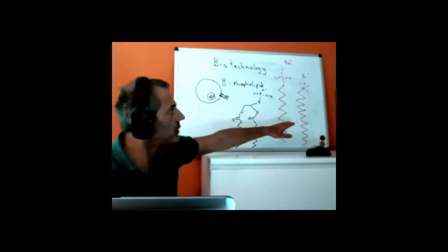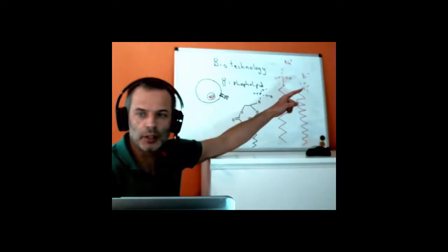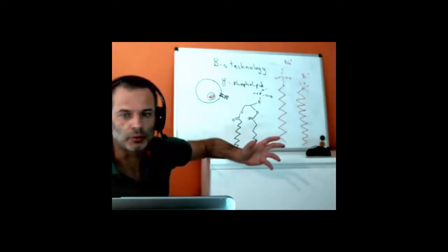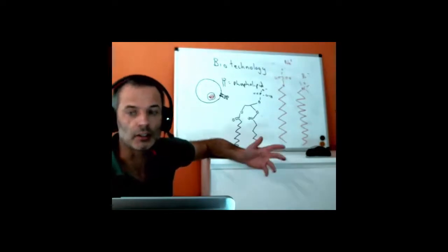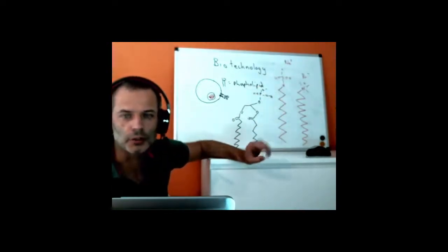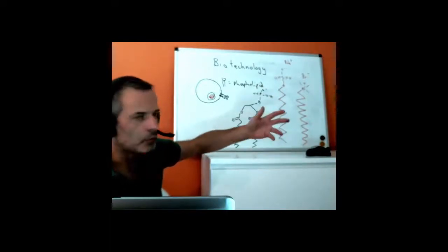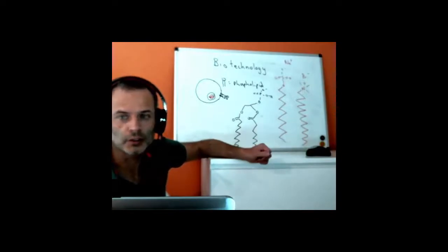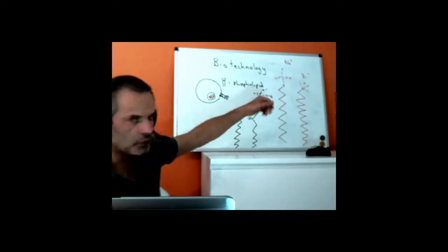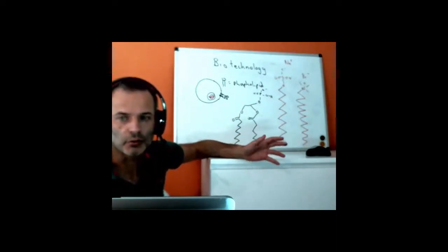So why is this one better? It's better because it's a positively charged soap, so that group there is effectively an amine where the hydrogens have been replaced with methyl groups. That means it can't lose them, which locks on this positive charge on the nitrogen. It would normally be NH4+, for example, but because we've got methyl groups instead, and the chain, it can't get rid of its charge, and so it's stuck in that form.